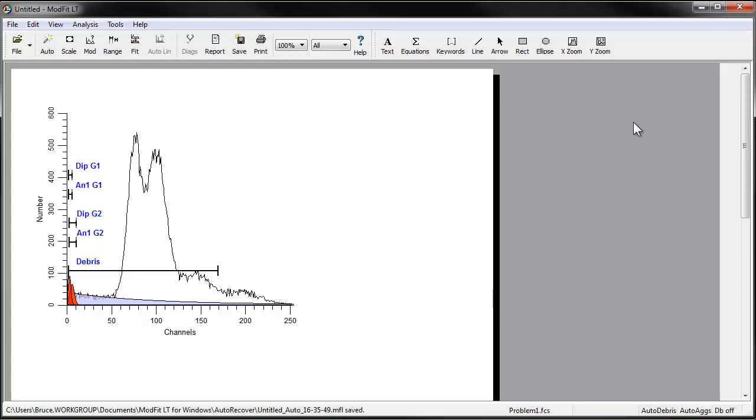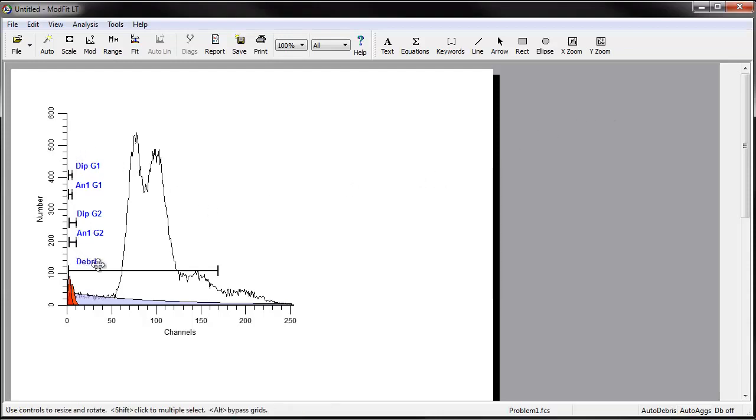ModFit LT will construct the model and try to position the model ranges over the peaks. It switches to the Range view automatically. You can see this view anytime by clicking the Range button on the toolbar.